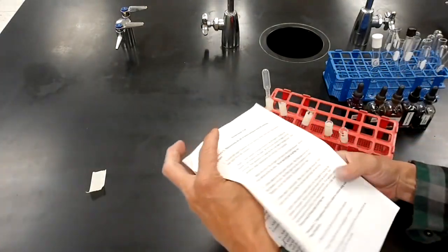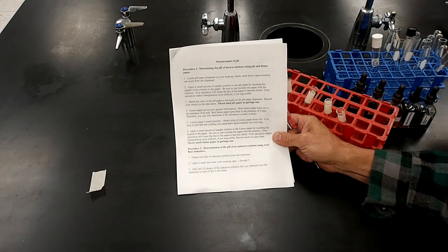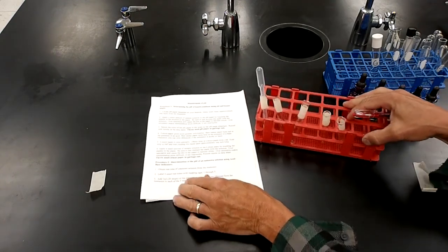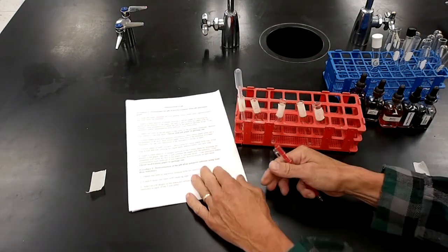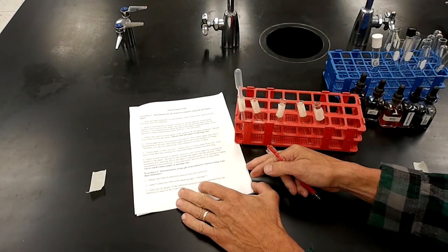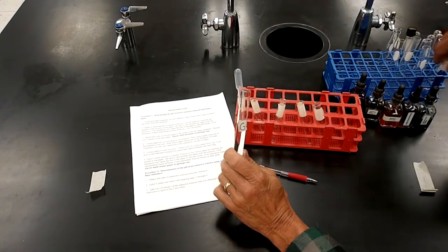Alrighty. What we're going to do now is procedure 2. It's determining the pH of an unknown solution using an acid-base indicator. All right, I've got five test tubes, numbered 1, 2, 3, 4, and 5. I'm going to add about 20 drops of an unknown solution. Here's my unknown solution. I don't know its pH.